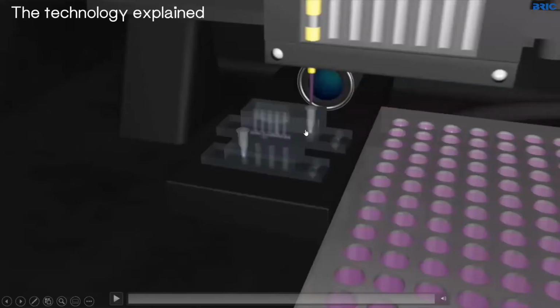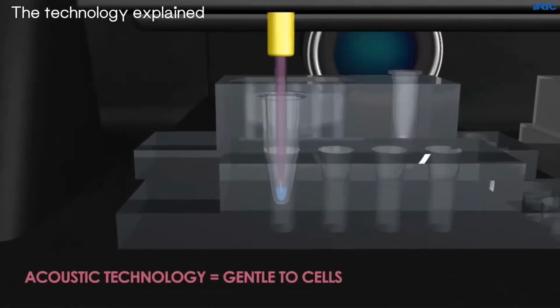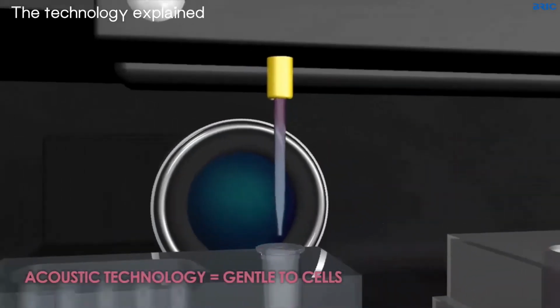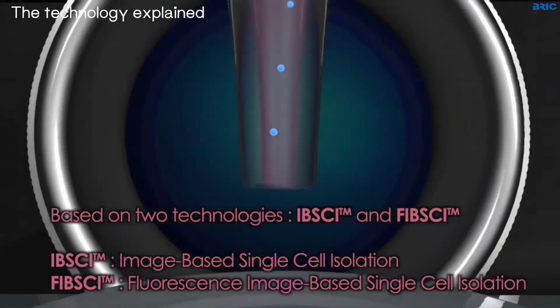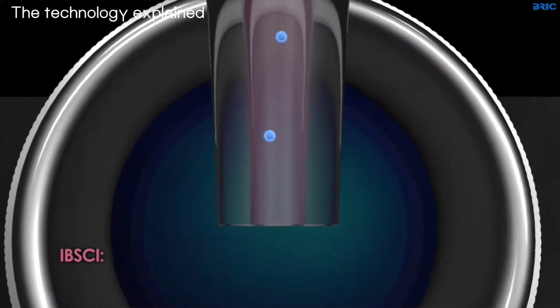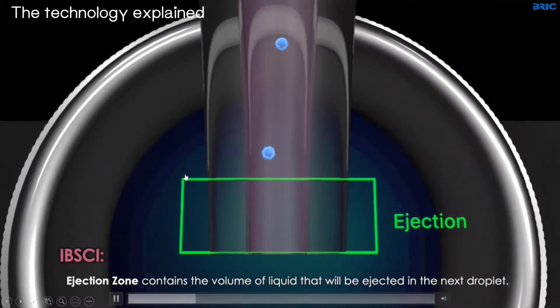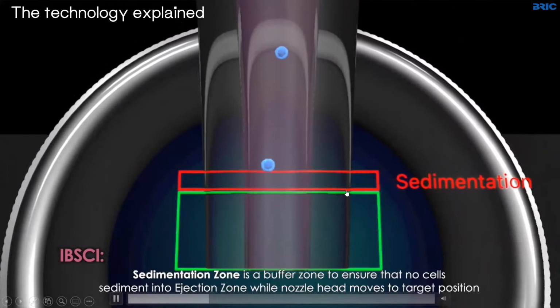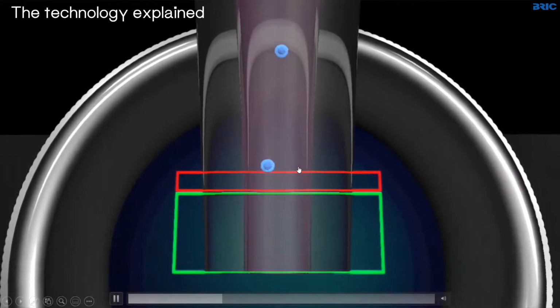So I have this little animation that's going to show you how it works. So we start always from an aspiration of a cell suspension into the dispenser. The dispenser is going to be positioned in front of a camera. It's kind of a microscope. Then we look through the dispenser, 2 modes of visualization, one which is equivalent to a bright field microscope, one to a fluorescent microscope. At the tip of the dispenser, we have this ejection zone, which is the equivalent of the volume of 1 droplet. And this sedimentation zone that is there to account for the fact that cells sediment when there is no action.